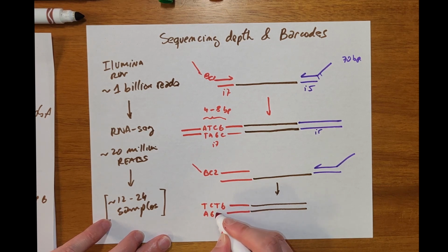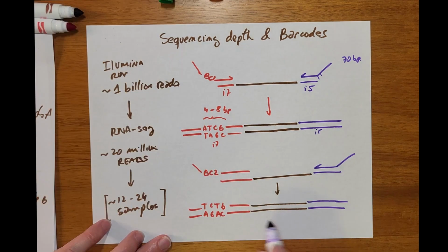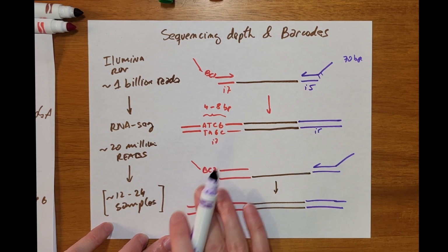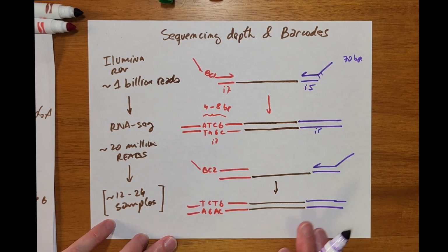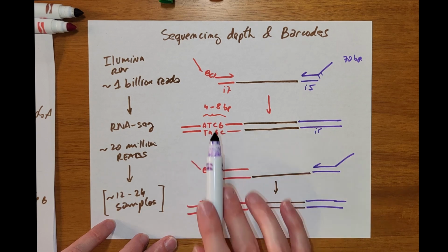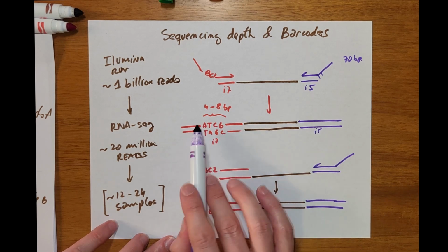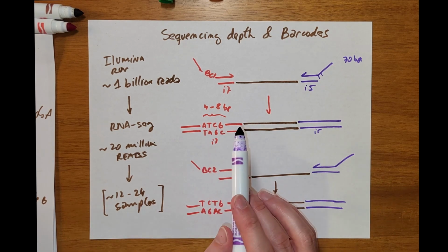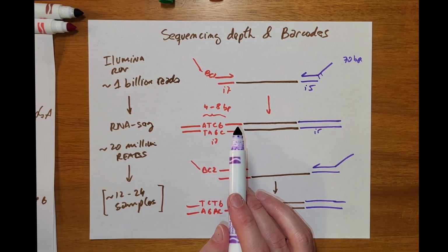This is the reverse complementary. So that's barcode 2. And there you go. So here the barcodes are incorporated within this I5 or I7. And these are primers, these I7 or I5, of which you know what is the barcode. And you say, okay, I will use this barcode to label this sample. And you have to have this information.